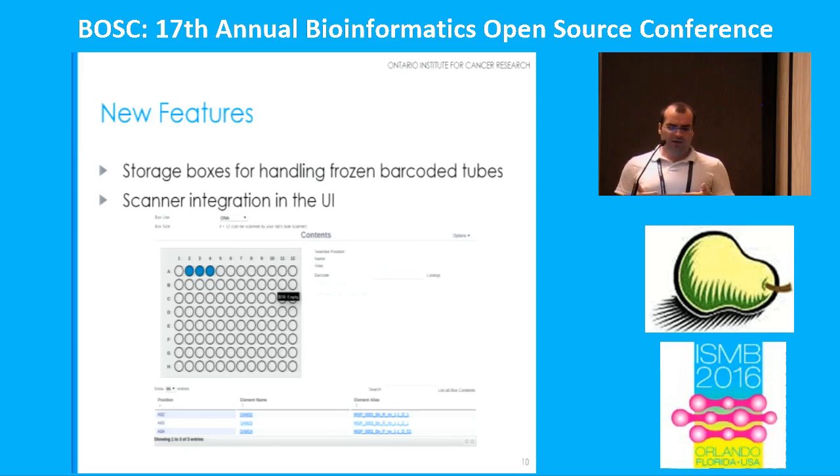We also have bulk scanners for our boxes in the lab. And once again, it was a lovely Excel-based process where they would use the software, download the barcodes, manipulate that in Excel, paste that into a text box in GeoSpiza, and then have that. Yeah, people's eyes are getting wide. I like that. When I saw it the first time, I'm like, oh, okay.